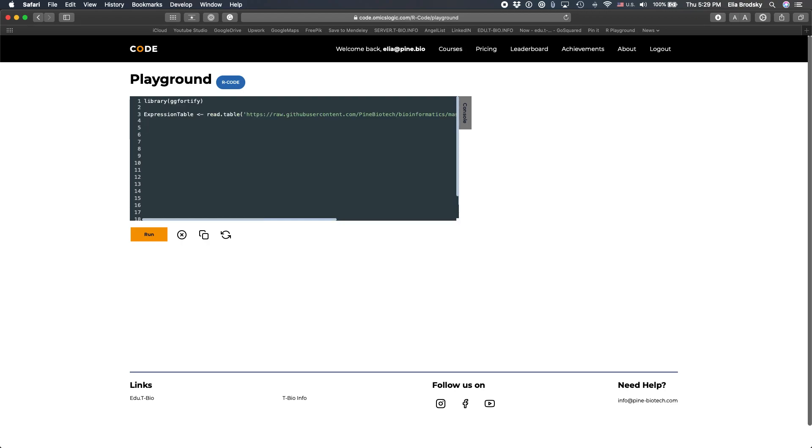Now, the next thing we want to do is create a data frame. From the expression table, if you actually look at the expression table, you'll see that there are first two rows that have the name of the sample and the group ID. So let's view this expression table. To do that here, we'll do print and expression table. That's right.